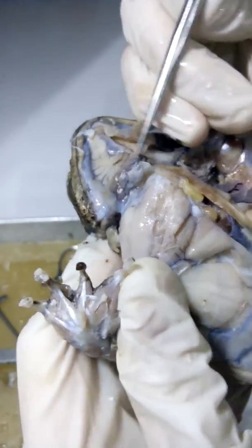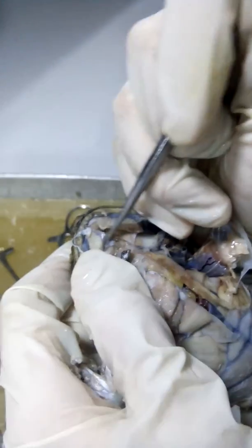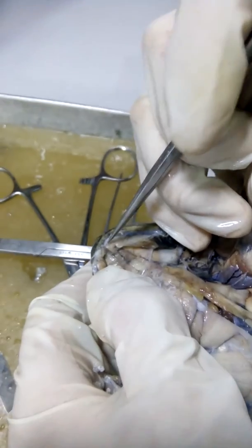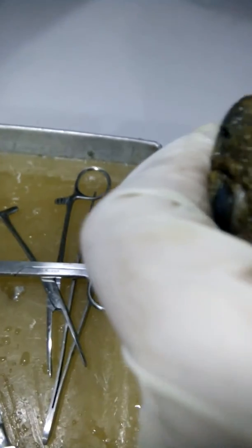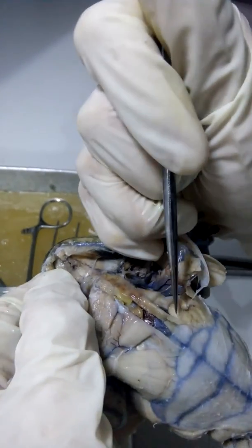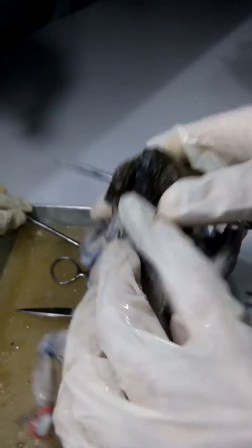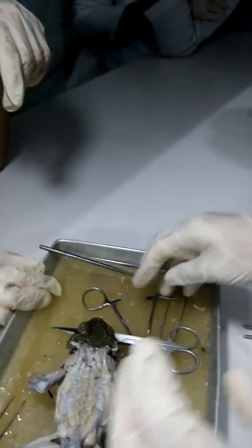And then above, if ikita pa nimo siya, mas makita nimo ang genio. This one right here is your, unsa man ni siya? Your most anterior, just below your jaw. That's your submentalis or submental. So this right here is your genioglossus. So sternohyoid. Okay, so I think that was all for the muscular system of the frog. Sige. Okay, we're done.